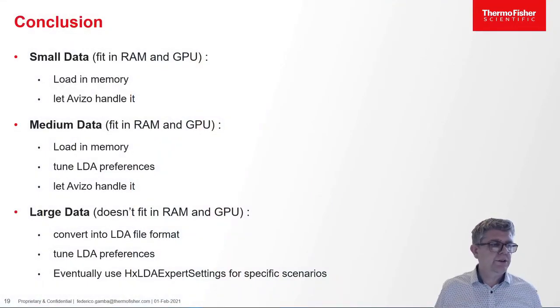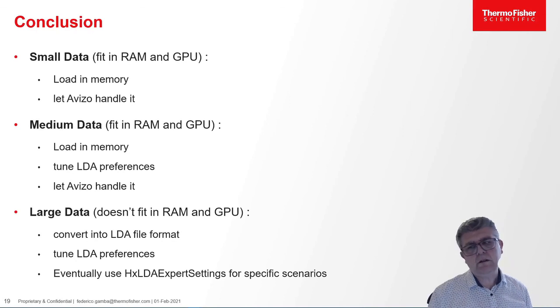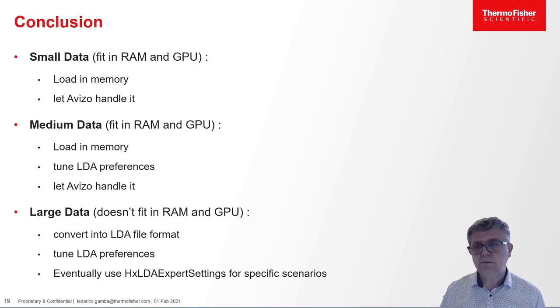So, conclusion. Small data, you probably don't need to do anything. You just load it in memory and that's it. Medium data, you have to carefully look at the preferences to increase the memory dedicated to visualization. Otherwise, even if it fits in RAM, you may see quality issues, so you have to do that.